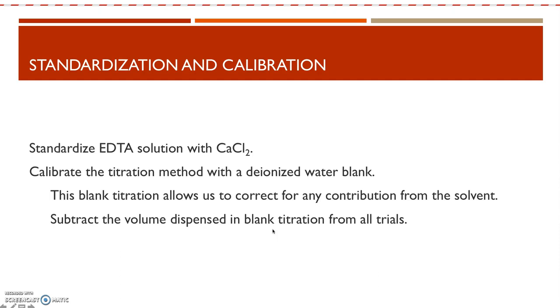Conceptually, this is very similar to what you did with the spectrophotometer, in the colorimeter, when you did dyes in drinks, right? You calibrated the colorimeter with blank water, just deionized water, to say, I know nothing is here. There should be zero concentration. And so I could subtract that absorbance measurement from all of my other measurements, which is what the colorimeter did.